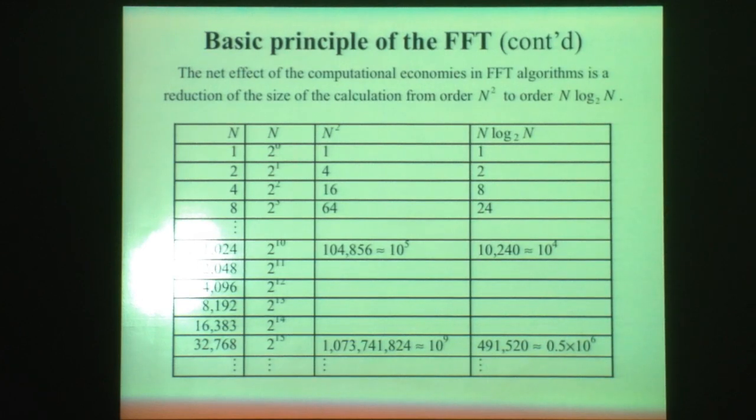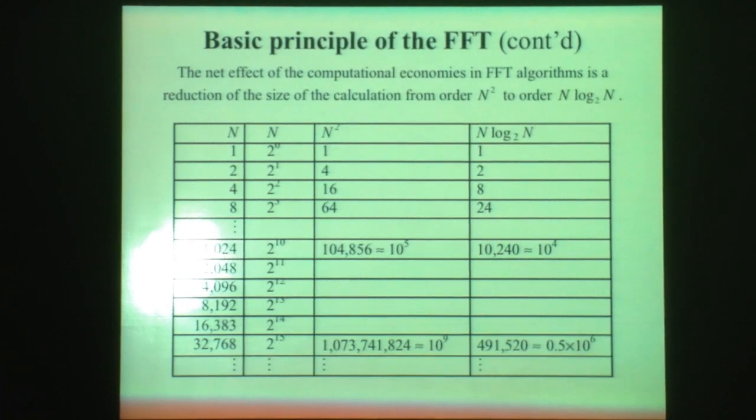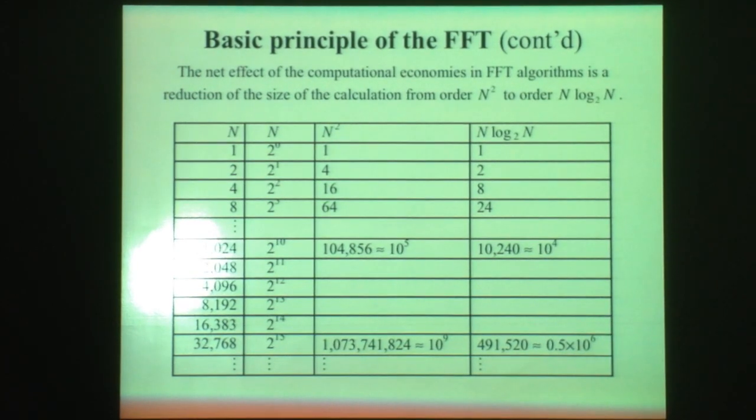And what he realized was that in crystallographic calculations, we can use symmetry to an advantage to further reduce the number of computational operations needed, so that the FFT algorithm can be made even more efficient if one incorporates symmetry properties depending on the space group of the crystal of concern.